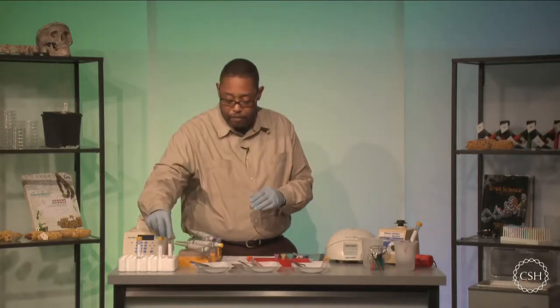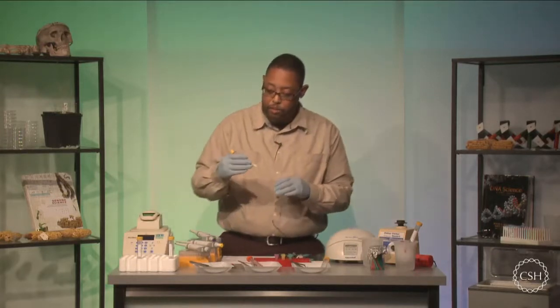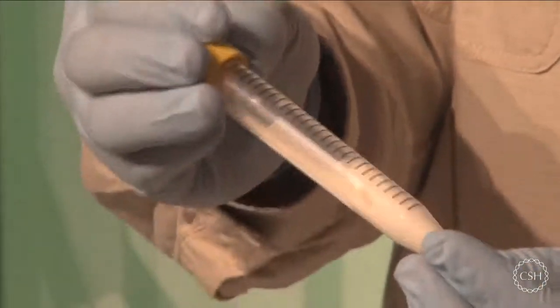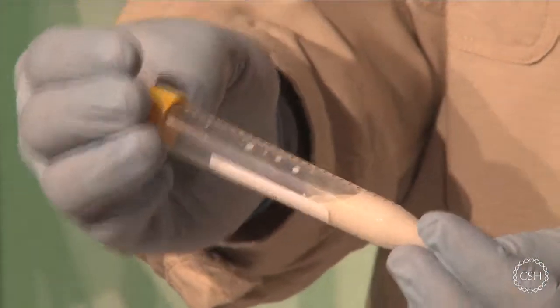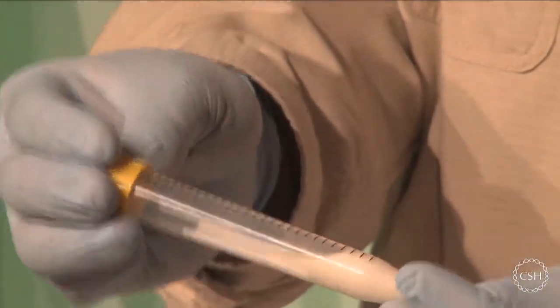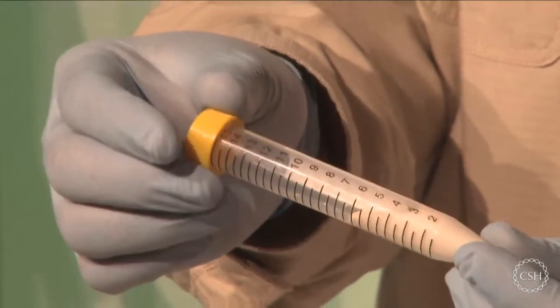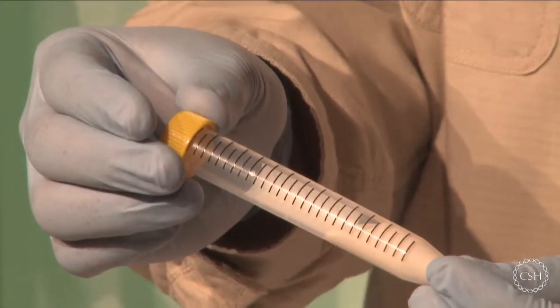I'm also going to have the silica resin physically here. And if you can take a look at this stuff, it's really milky. It looks sort of like buttermilk. This is also known as glass milk. But it's sort of thick, but looks very milky when you're physically in here. Okay? So silica resin will be the second reagent we use.